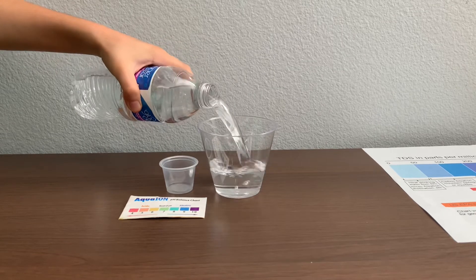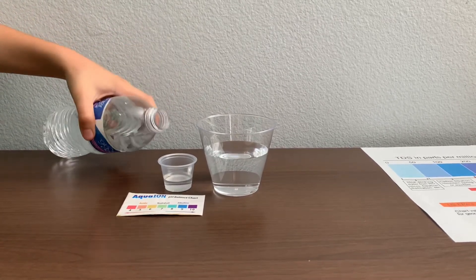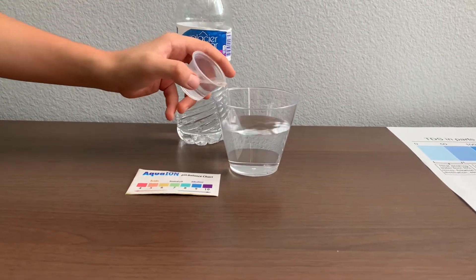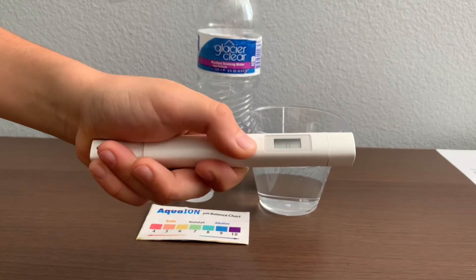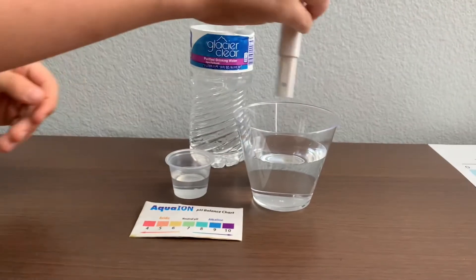Let's pour some water in. This is a little too much for the pH cup, so let's pour some back into the TDS. First, let's test the TDS level. Turn on the TDS tester and make sure it says zero before putting it in.